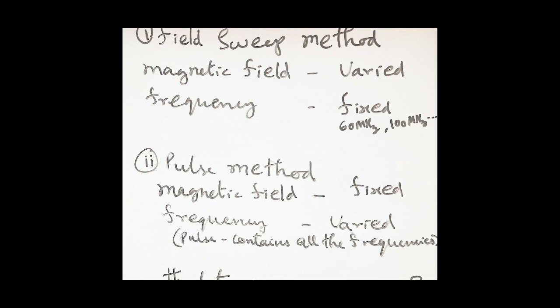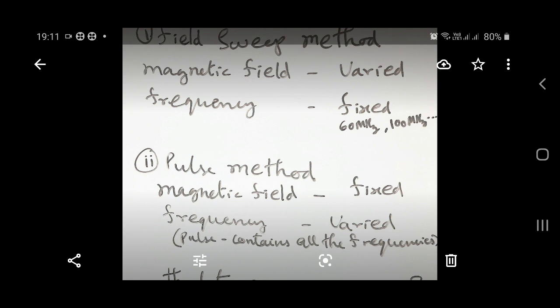So, to maintain uniformity in the data for a chemical compound recorded by any of these methods, a universal unit, a derived unit, namely chemical shift, was introduced. We have seen what is meant by chemical shift in the last class.